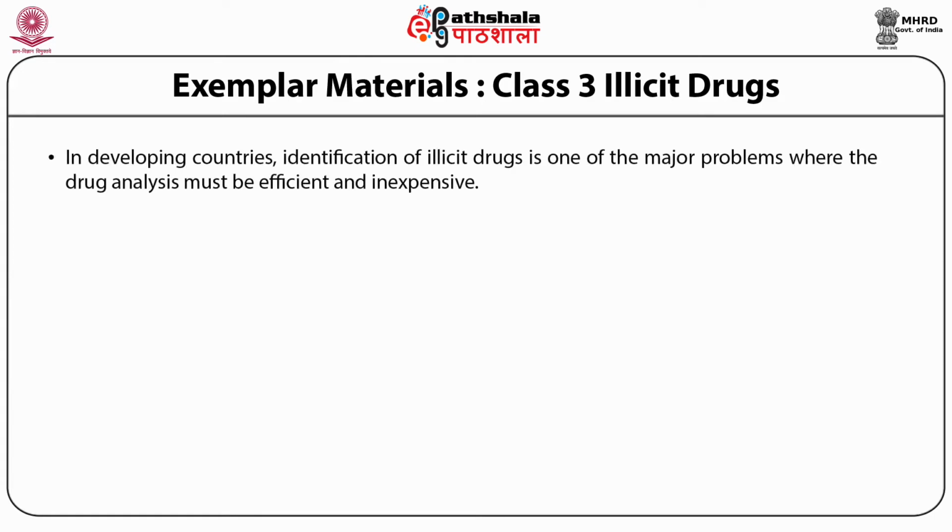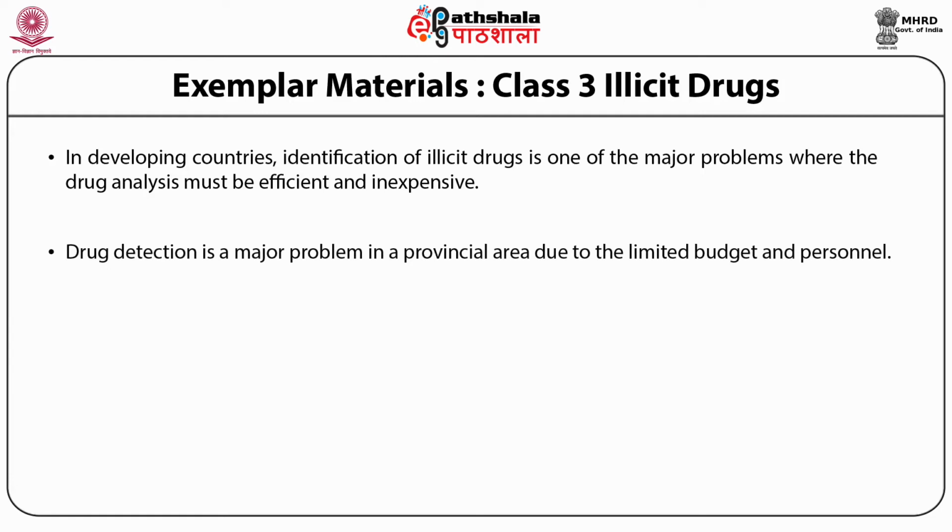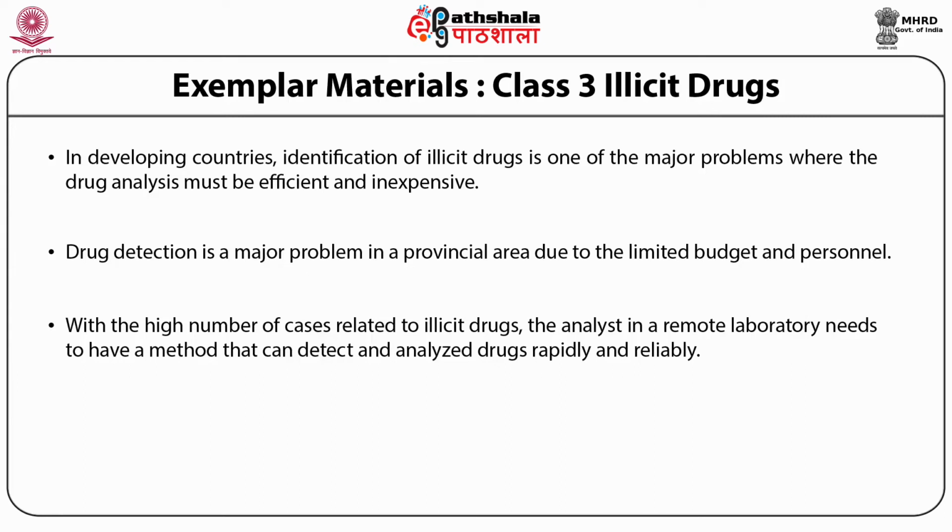In developing countries, identification of illicit drugs is one of the major problems, where the drug analysis must be efficient and inexpensive. Drug detection is a major problem in a provincial area due to the limited budget and personnel. With the high number of cases related to illicit drugs, the analyst in a remote laboratory needs to have a method that can detect and analyze drugs rapidly and reliably.